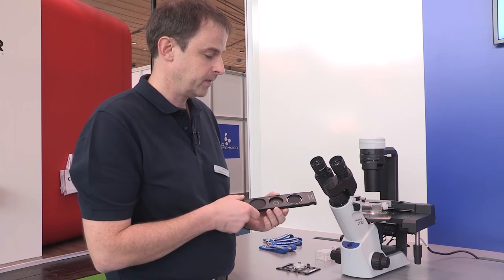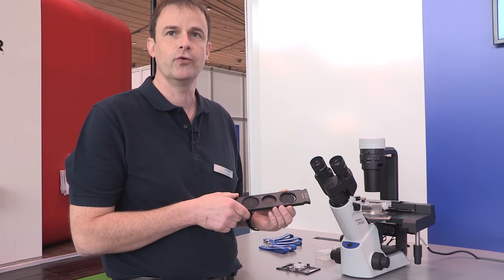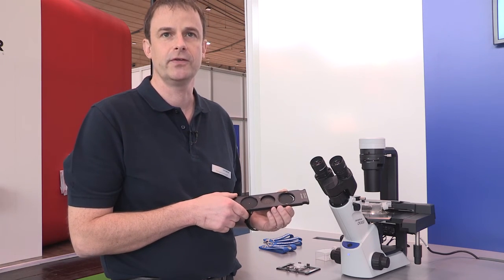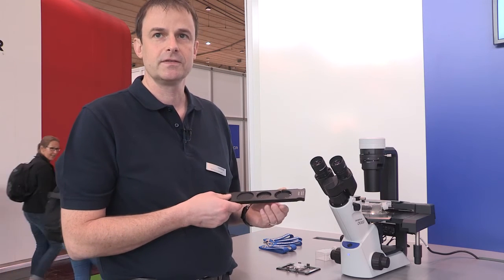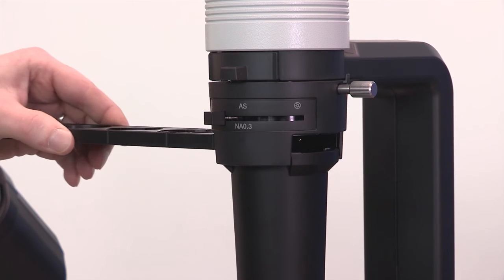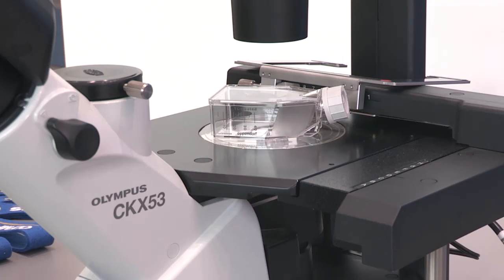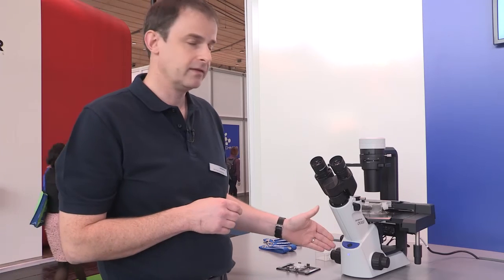Very excitingly, we have also developed a new contrast technique: the inversion contrast — the Olympus IVC contrast. This contrast gives you similar contrast as phase contrast but without any halos, while delivering crisp and clear 3D information of the cell culture.